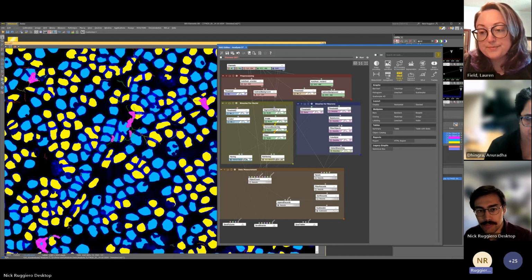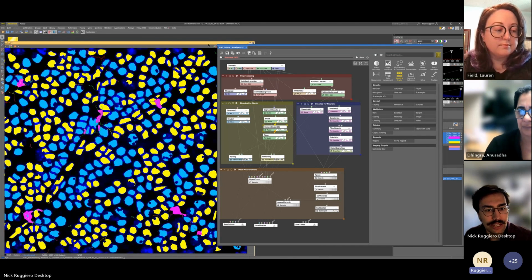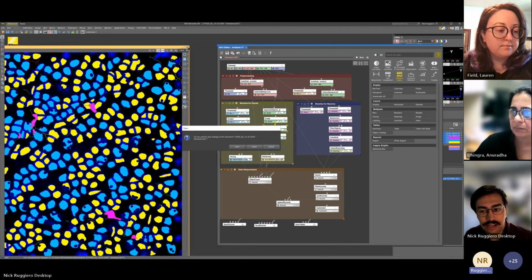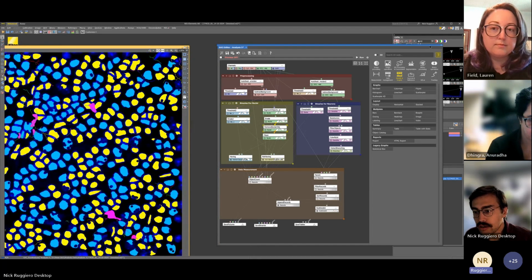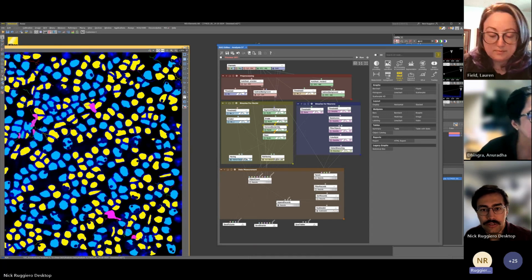I know you guys gave us a couple. So what I would do, I mean, we can test it. So let's exit out of this. We won't save that for now. Let's see, hopefully this works.